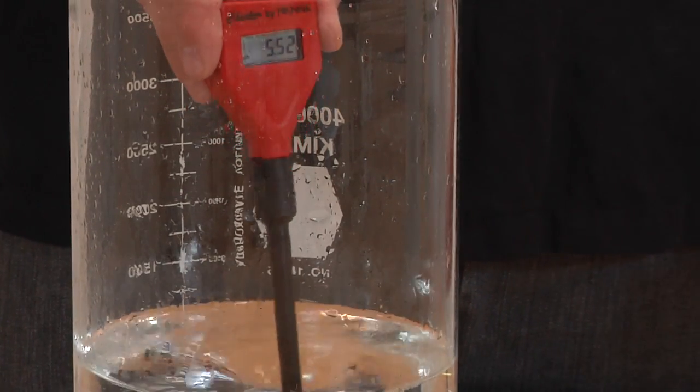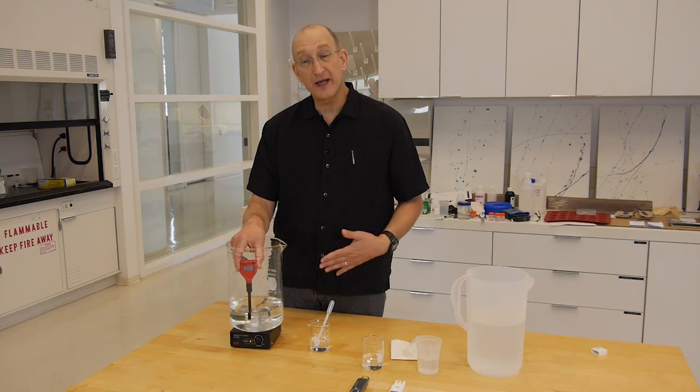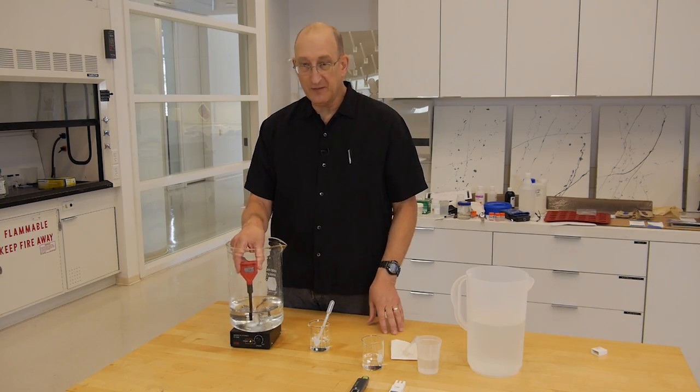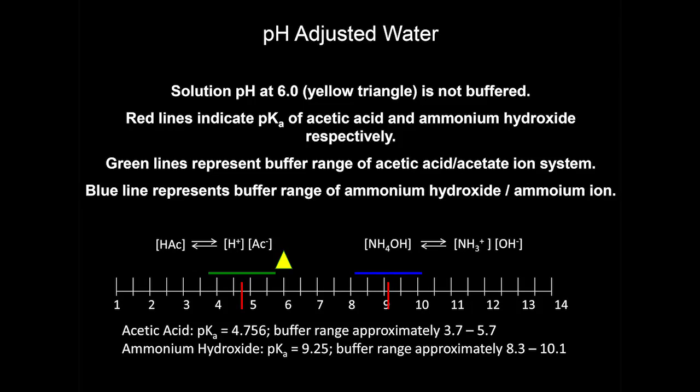We've added enough ammonium hydroxide to get the pH kind of close to where we want to go. We want to slow down the addition of the ammonium hydroxide. The pKa for acetic acid is 4.76, so its buffer range is about 3.7 to 5.7. So we're kind of just outside the buffer range. As we get to 6, we'll be outside the buffer range. So as we're adding ammonium hydroxide, the pH will change very quickly as opposed to what we saw a minute ago where it takes a lot of ammonium hydroxide to change the pH.